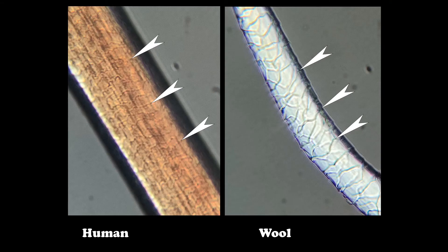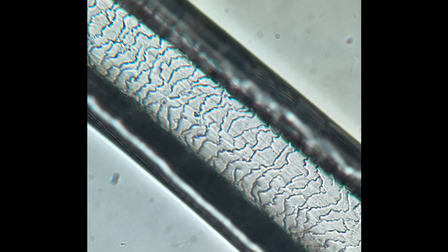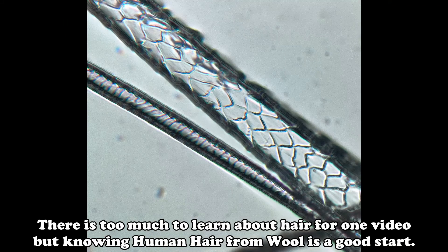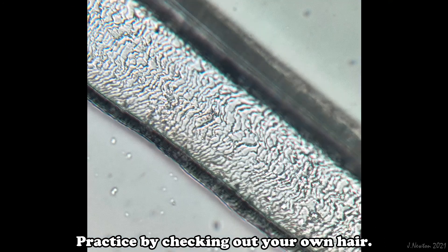Here you can see the difference between the imbricate scale pattern of human hair and the mosaic scale pattern of wool. There is a better way to see this scale pattern in greater relief with simple, clear nail polish. Check out the video on hair scale pattern preparation for more details.